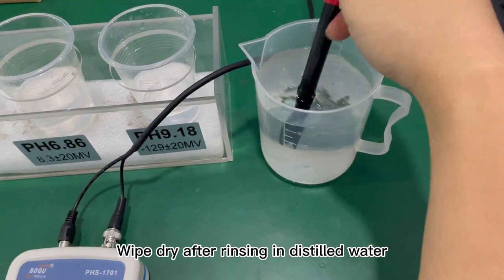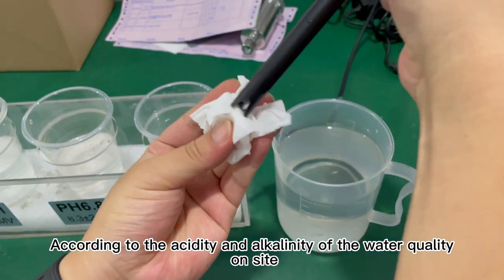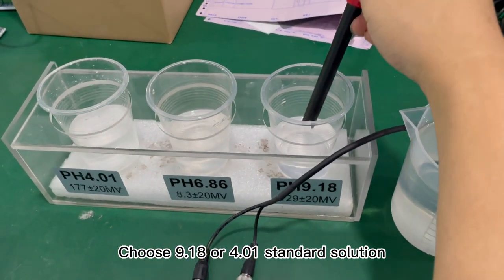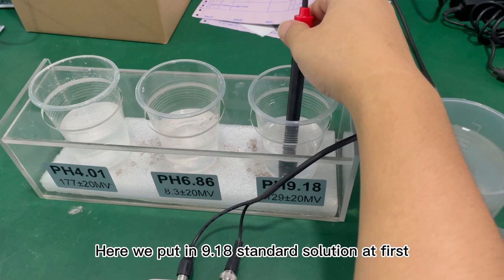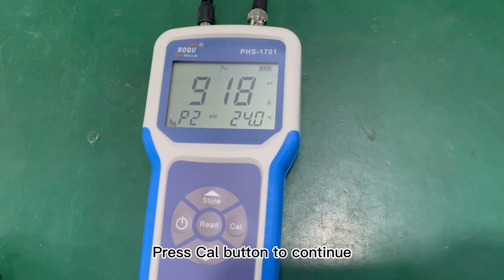Wipe dry after rinsing in distilled water. According to the acidity and alkalinity of the water quality on site, choose the 9.18 or 4.01 standard solution. Here we put in the 9.18 standard solution first, then press the Cal button to continue.